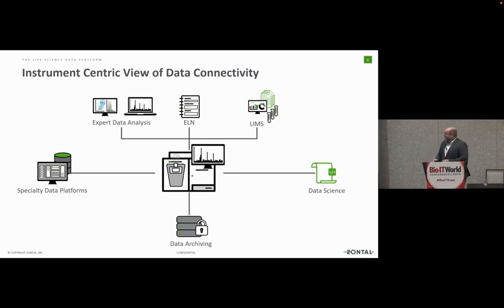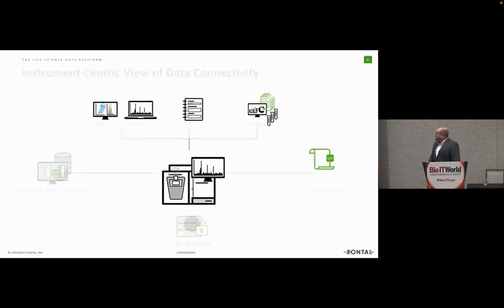But yeah, in the end you also have, and this is a big thing for every company out there, you would like to archive your data. You would like to make sure that you can actually, after 5 years, still find that data and still be able to interpret it. Not only view the data, but really do something with it.